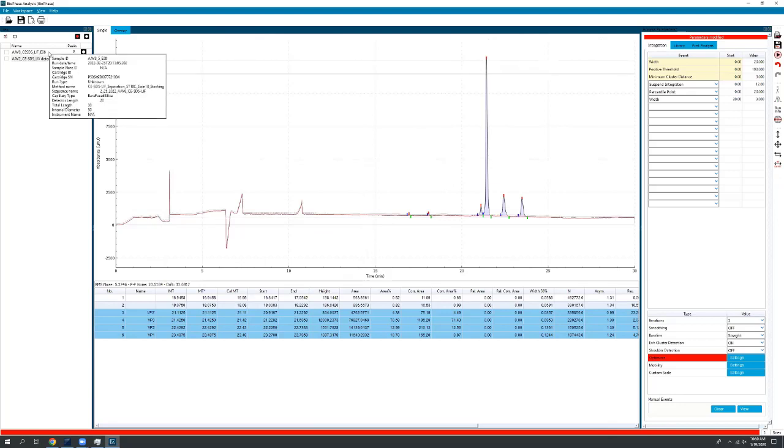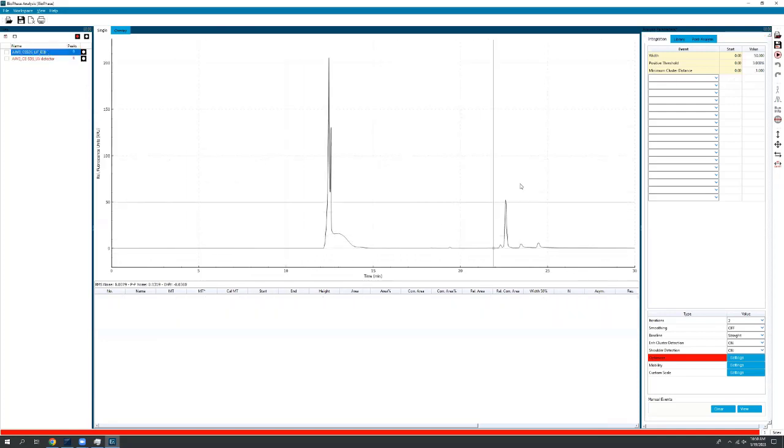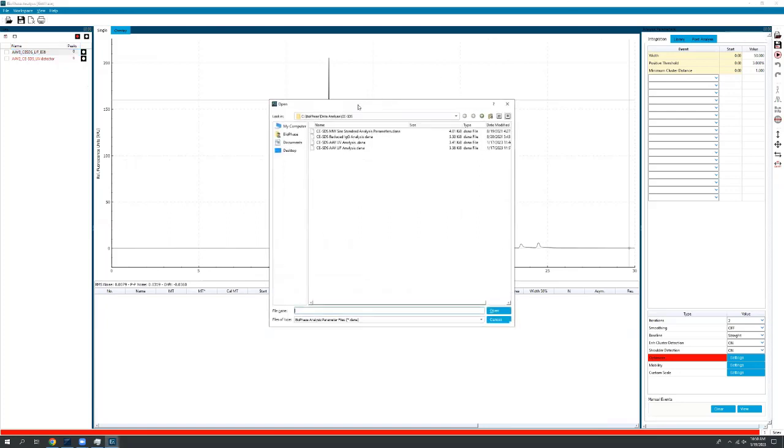Now, that's a pretty good titer sample, and we can use our UV detection on it. But what about, like you mentioned, those in-process samples? Well, that's definitely where LIF comes into play. So we're still using the same separation buffer, still getting the same resolution between the peaks, but we have much higher sensitivity.